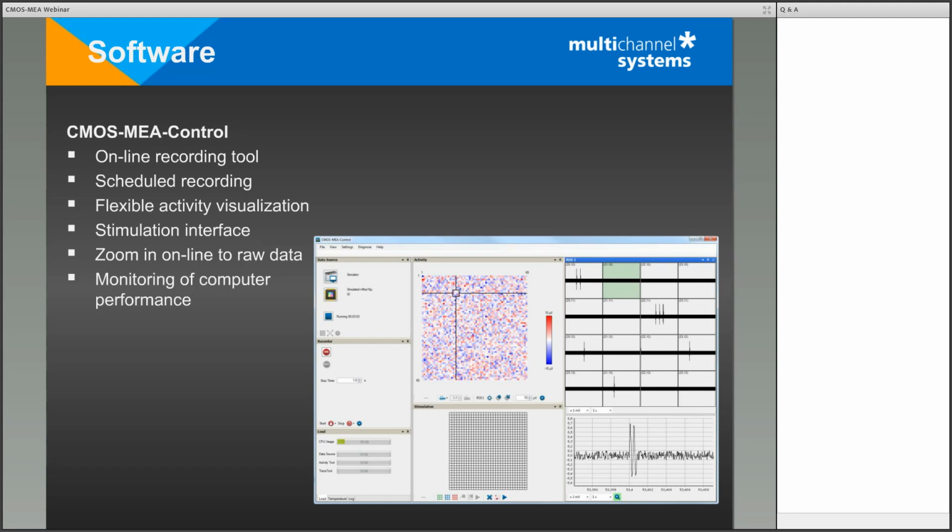That simply doesn't work. And it wouldn't help you anyway, because you're simply not able to look at 4,000 channels and actually see what is happening. So what you need is to boil the activity down to a simple color scheme where you can actually spot where the activity happens. Then you have that little region of interest here, which you can move around.